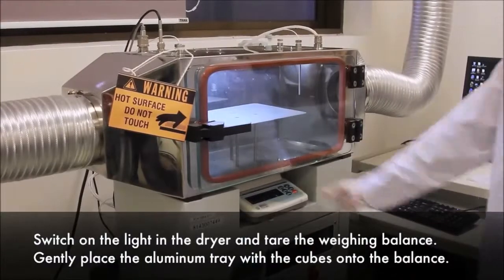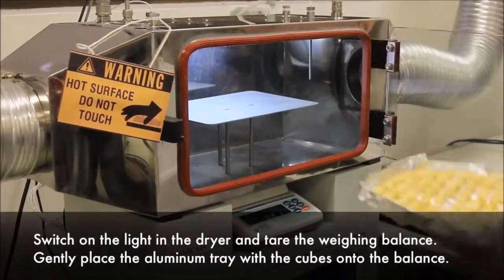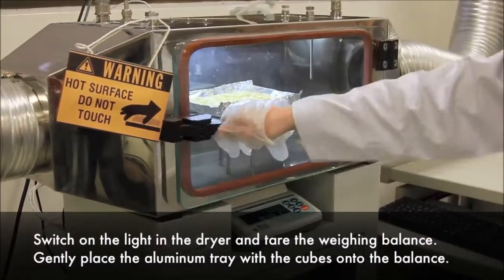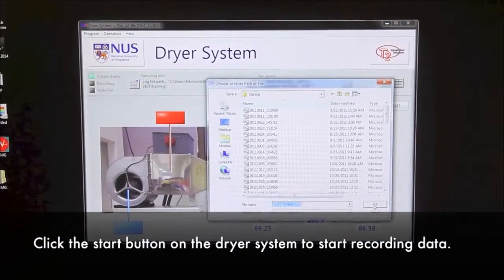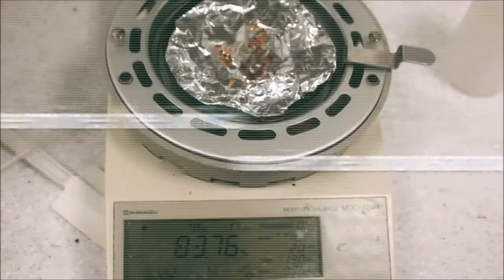Switch on the light in the dryer and tare the weighing balance. Gently place the aluminum tray with the cubes onto the balance. Click the Start button on the dryer system to start recording data. The experiment is allowed to run for 15 hours.